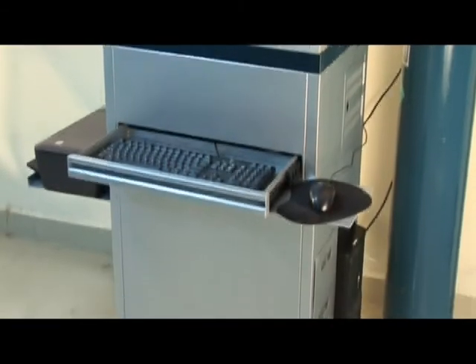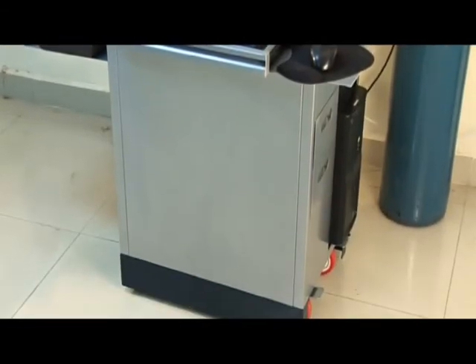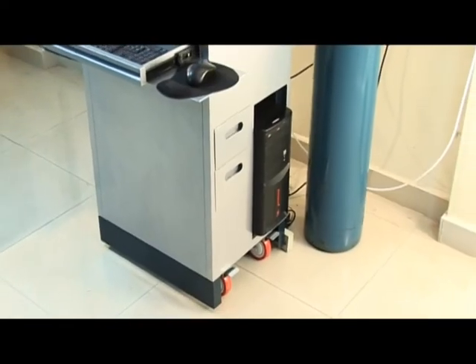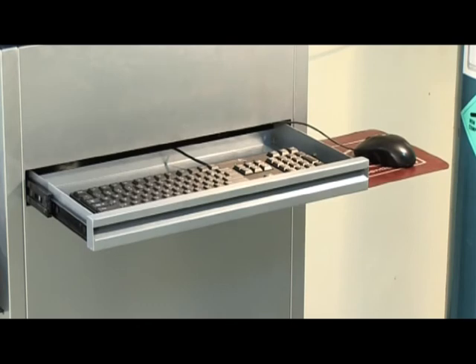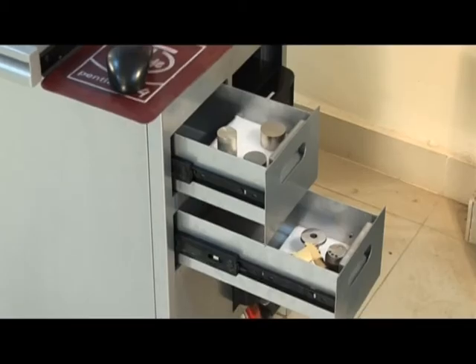The MetaVision is placed on an attractive pedestal, which ergonomically houses the PC, printer, keyboard, mouse, and samples.